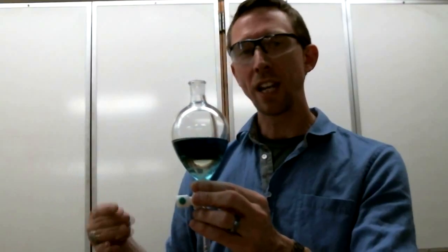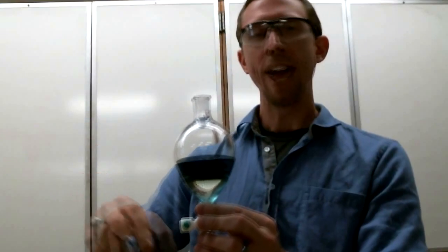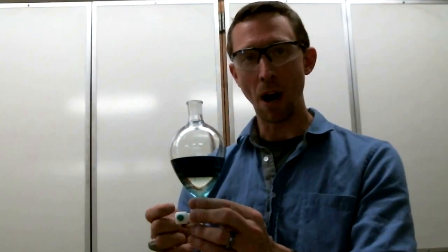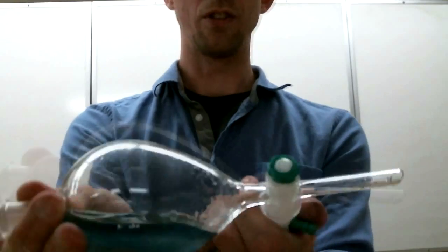So I'm going to give them a little bit of help by agitating this mixture, creating many, many small inclusions of one solvent in the other, and thereby creating a massive amount of surface area through which these blue dye molecules can move, essentially giving them the choice which solvent they want to be in. So let me do that now. Just a nice, gentle agitation.